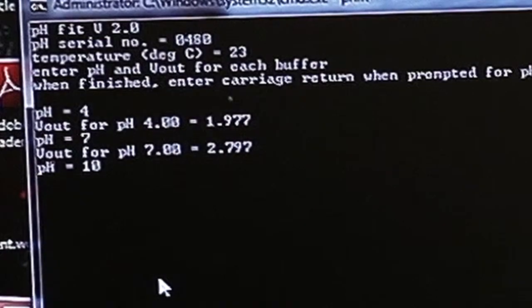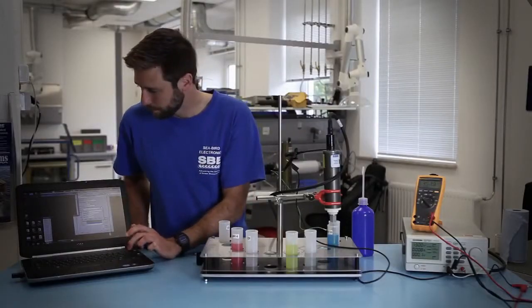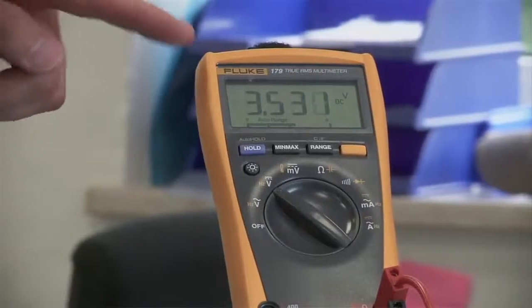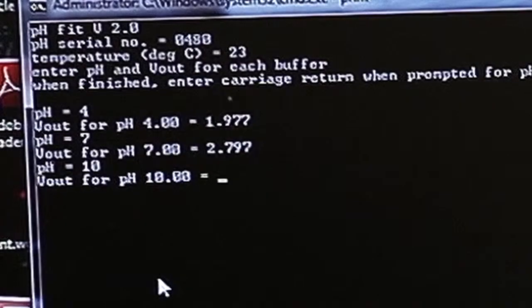So we'll enter in the new pH buffer and record the voltage out, 3.534.